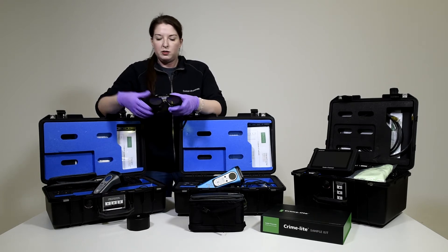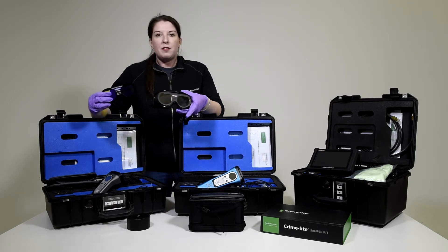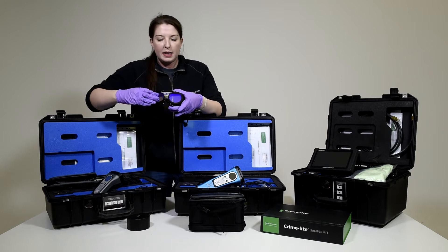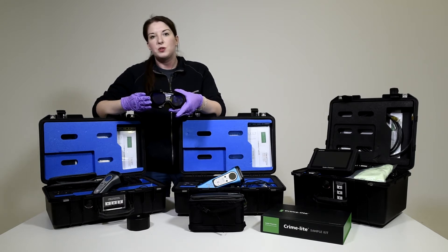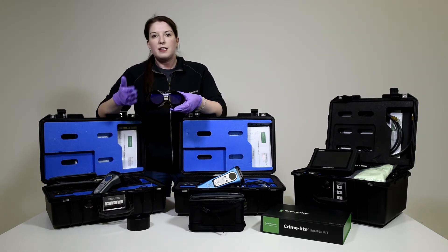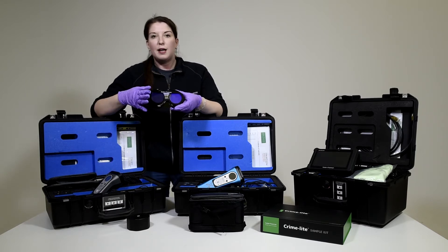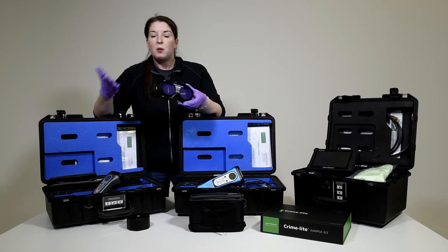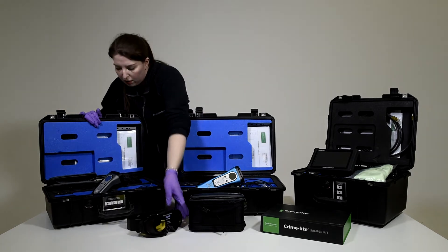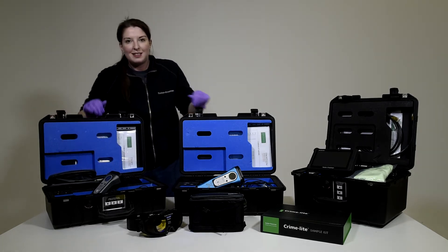One of our latest products is our new ProVision goggles. By themselves, these act as a UV safety goggle. But instead of having to have lots of different goggles for each different light source, we have magnetic filters that simply click onto the front depending on which light source you are using. With fluorescence, it's really important to use the goggles because this blocks out the excitation light and allows us to easily view the fluorescence — whether that's fluorescent fingerprints, body fluids, or other trace evidence. The kit includes your ProVision goggles and a number of different magnetic filters.